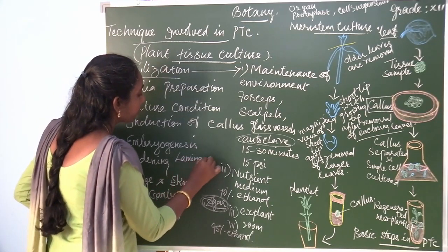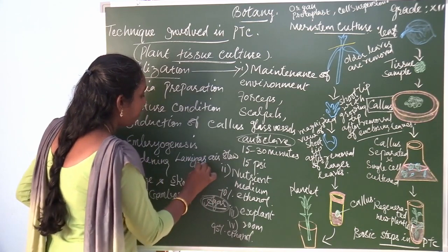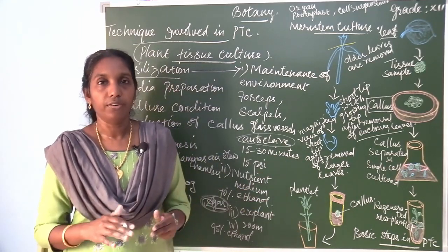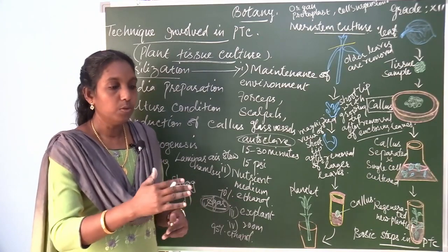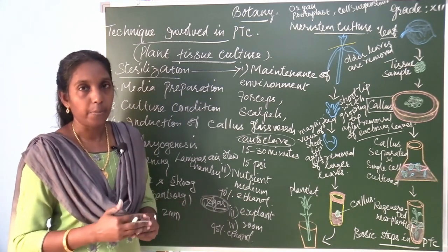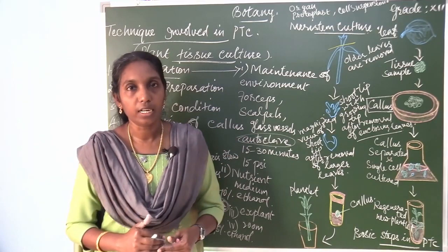Laminar airflow chamber. The laminar airflow chamber or laminar airflow bench. Here the air is moved in the same direction, without allowing any cross air that could bring in microbes. So, it maintains aseptic conditions.